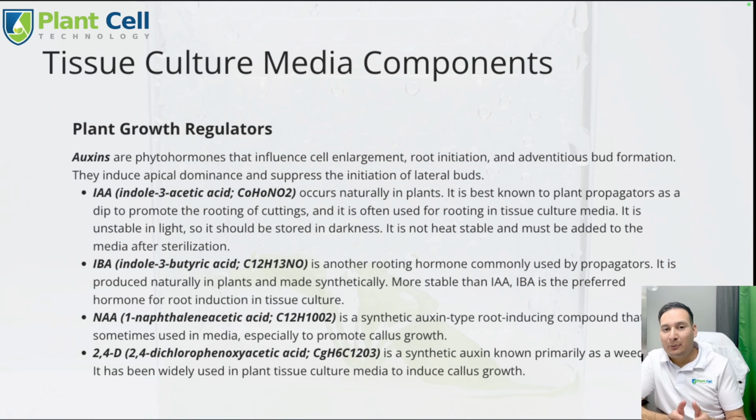Again, I want to run some experiments. I did an experiment where I was trying to regenerate plants using leaves instead of nodes, and I think the use of 2,4-D will help me out with that.